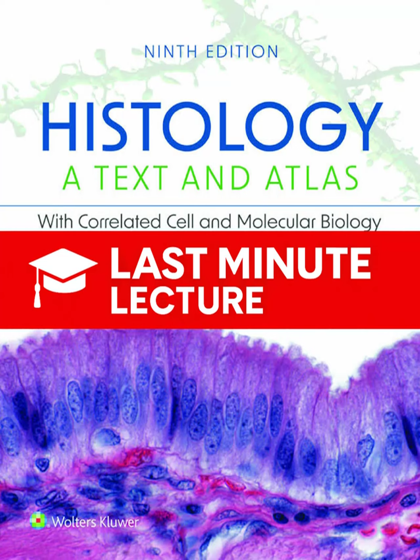Why is that mordant so important to the H&E process? Why not just use a simpler basic dye? Because the final tissue-mordant-hematoxylin complex is much, much more stable than a simple electrostatic link. It's so stable that it stays attached during all the watery and acidic washes that come before you add the eosin. So a less stable dye would just wash away. It might just dissociate and be lost. The mordant is key to the whole two-step process.